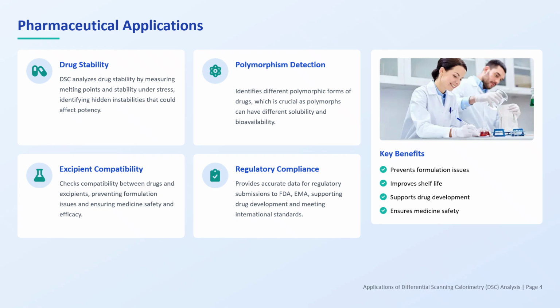DSC is also used for excipient compatibility. A drug and excipient may look compatible on paper, but DSC can reveal subtle interactions that could reduce shelf life or efficacy. Finally, DSC data supports regulatory submissions to agencies like the FDA and EMA, providing robust thermal characterization that regulators expect.